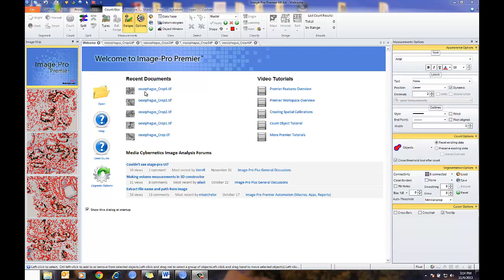This is a short movie showing ImagePro Premiere version 9.1 and how to set up and use the Learning Classification feature. The Learning Classification feature is used to classify objects, or in this case nuclei, into a set of defined bins or classes.